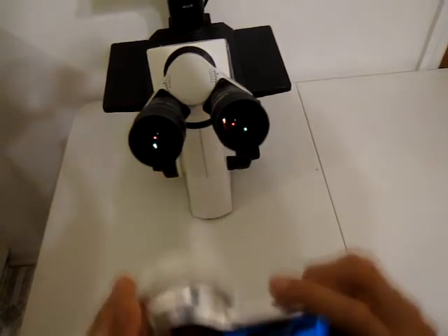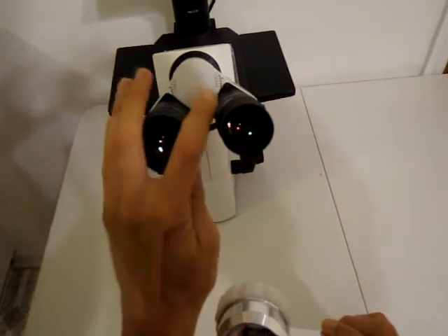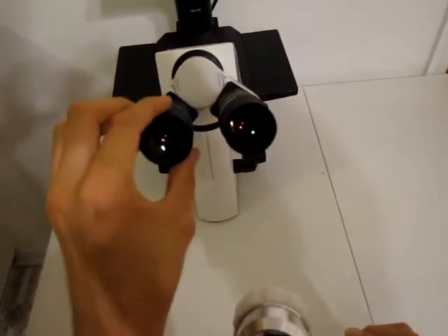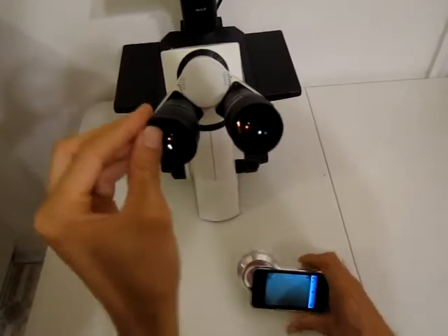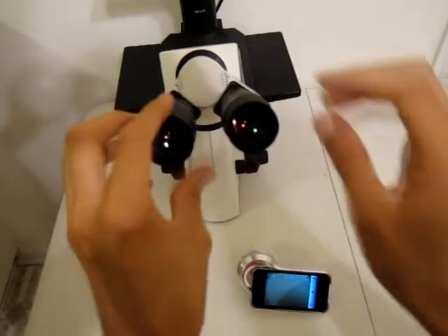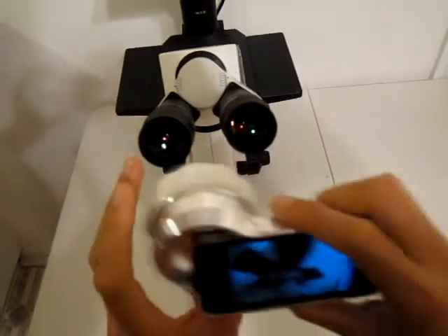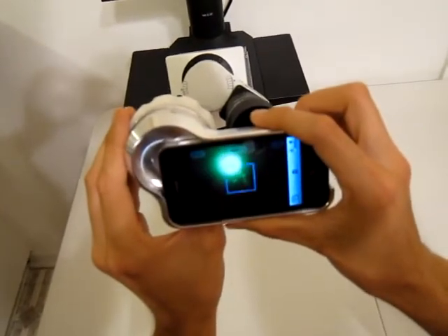To attach the microscope adapter, make sure that the hood — this hood is usually folded back — fold this hood forward and place the adapter over the eyepiece.